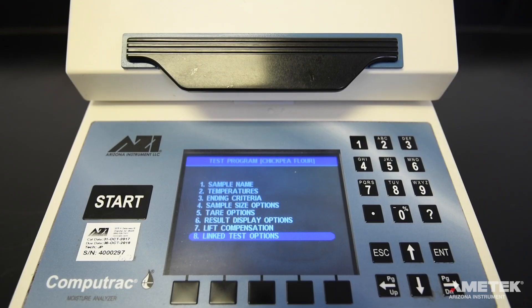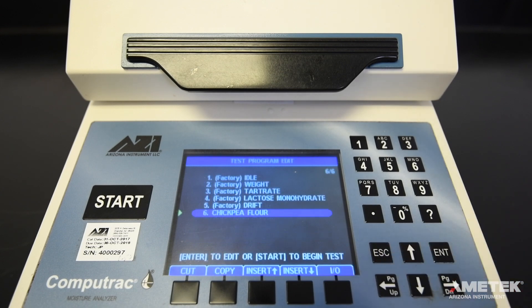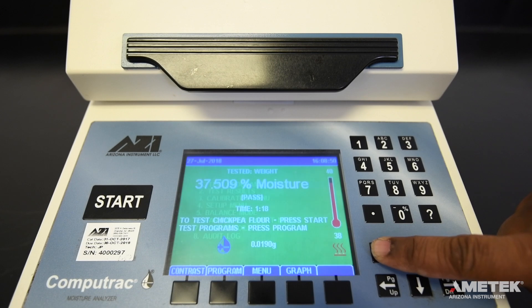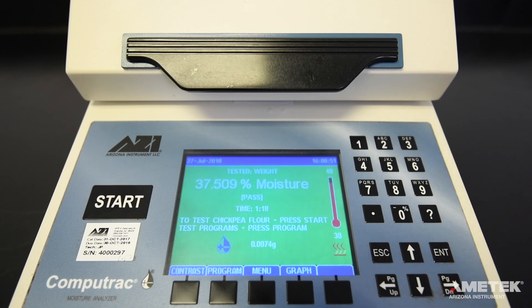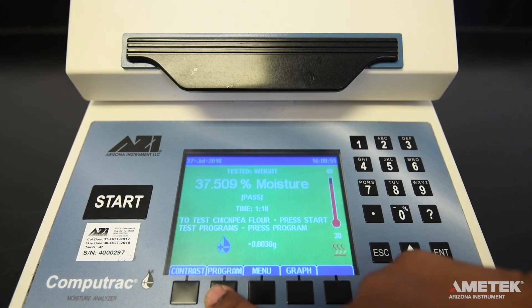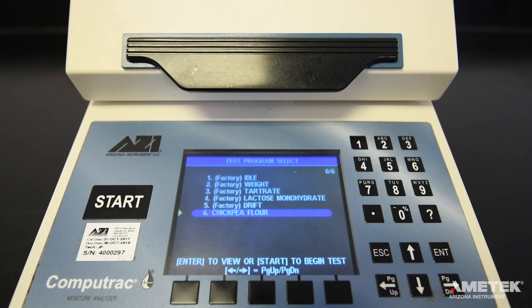Now that all your parameters are set and saved, press escape until you return to the home screen. You have now added a new program to your CompuTrack Max 4000 XL or Max 4000 and can find it in the program list by pressing program. With your program in place, you are ready to run a test.